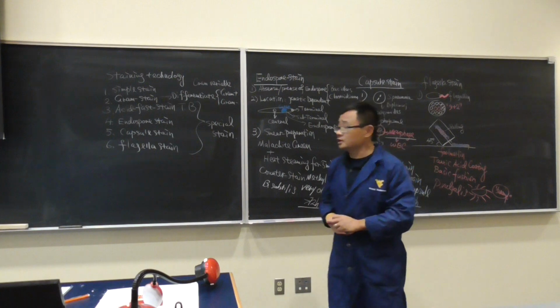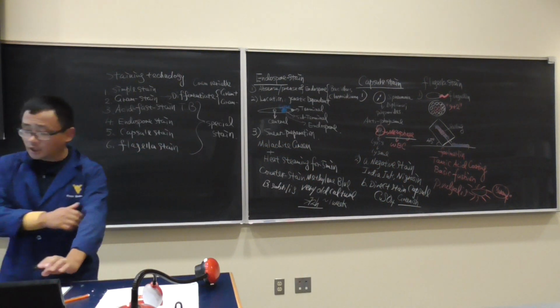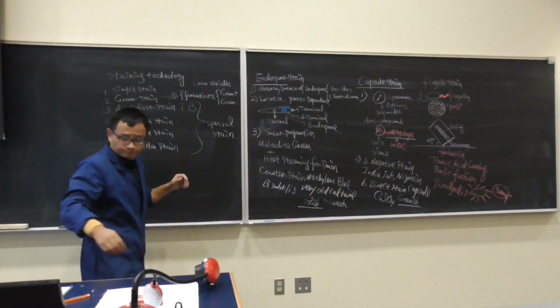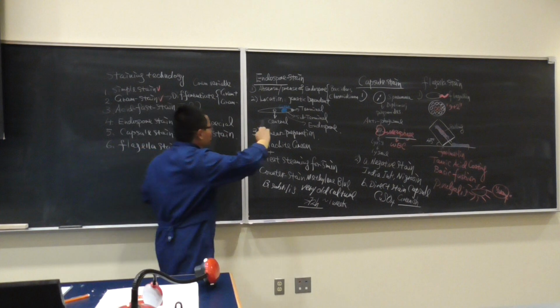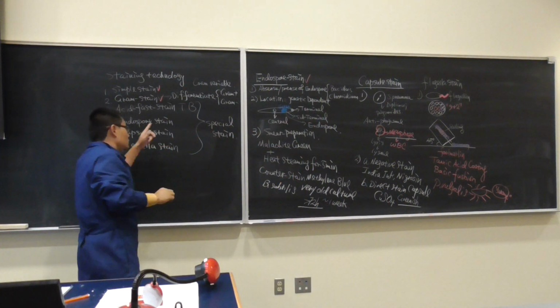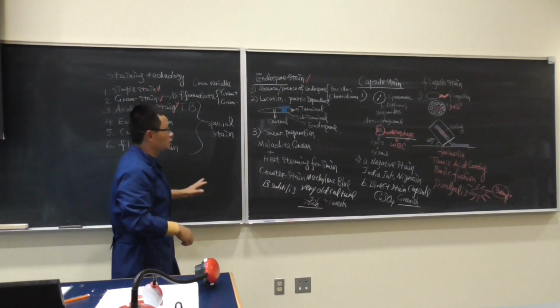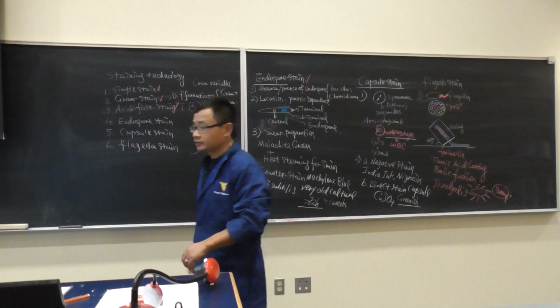Okay, so here we finished talking about the staining technology. Because of the time and the lab facility, we can do simple stain, gram stain, endospore stain, and acid-fast stain. I do not have Mycobacteria anymore, so we skip that, but originally we could do that one. But for the others, we're not going to do it, because the condition is not that good, so we didn't do it.